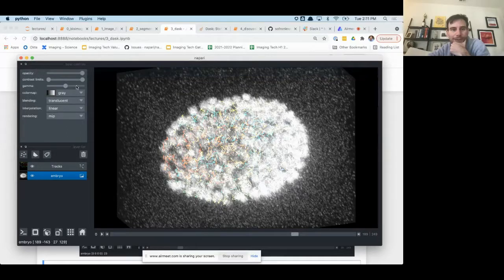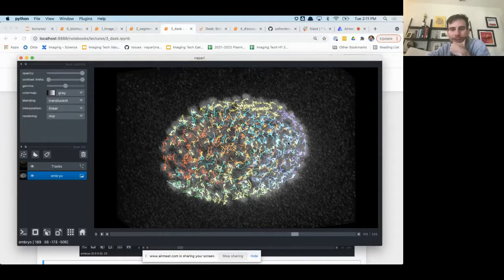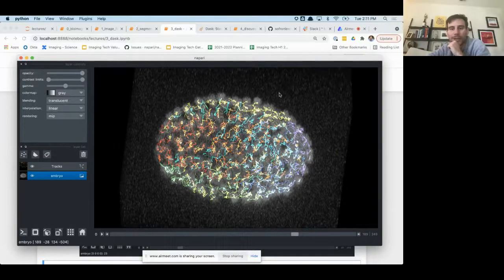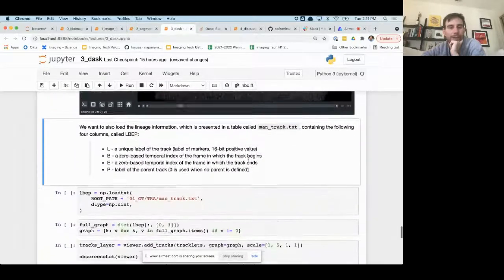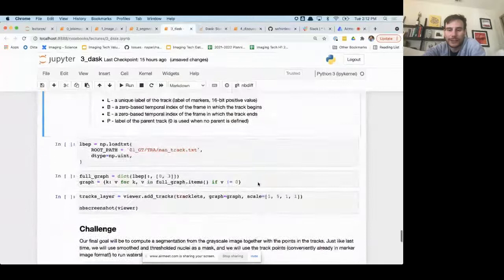That's saturated there. That's interesting. Maybe if I come in here. Okay. Yeah, but at the end, the raw image is saturated because I guess they compressed it. And so we can also look at different color maps as well. It's pretty cool. You can see the cells around too. And underneath this now, it's a Dask array that's lazily loading in each time we move as well.